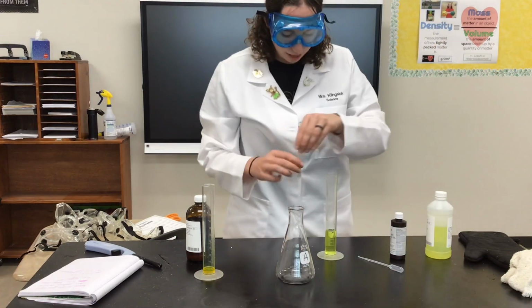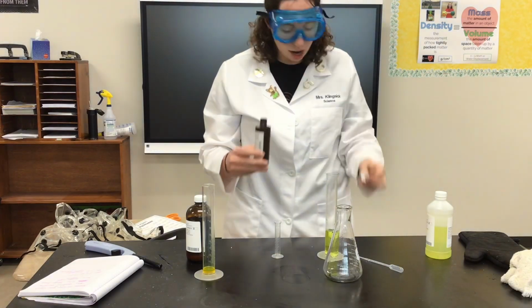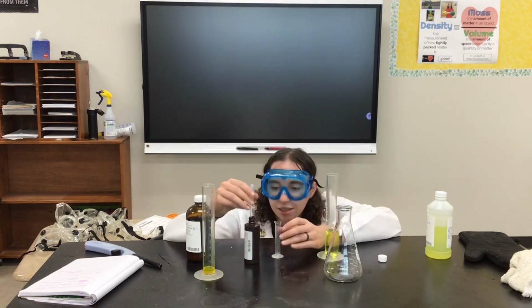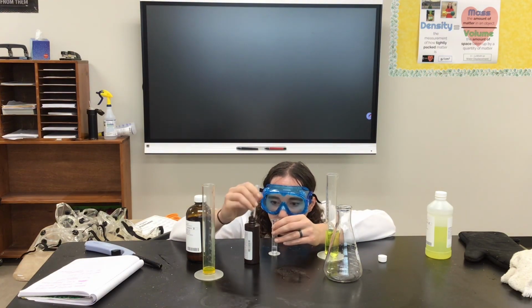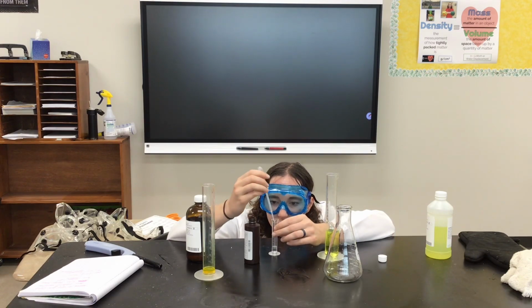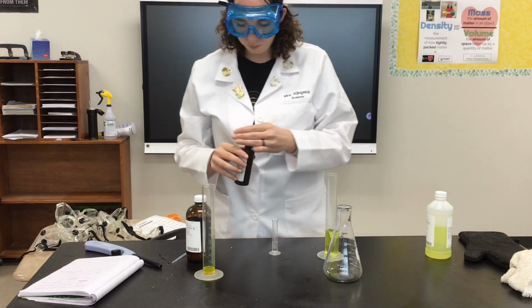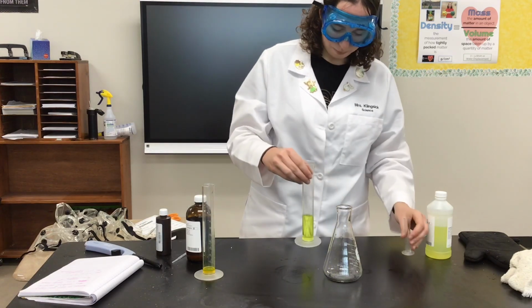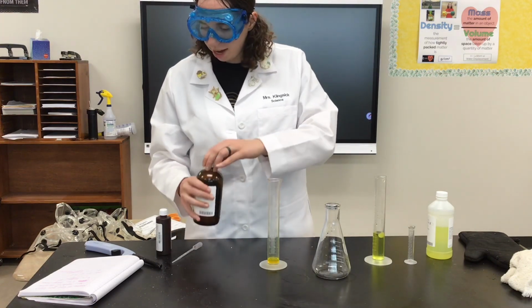And then into this, I'm going to add 3.5 milliliters of hydrogen peroxide. So just a little bit. Oh, oopsie. All right, so my pipettes. 3.5 milliliters. Don't need a lot. Isn't this so cute? And there we go. Perfect. Okay, and I'm going to add this into here. Okay, swirl that around.